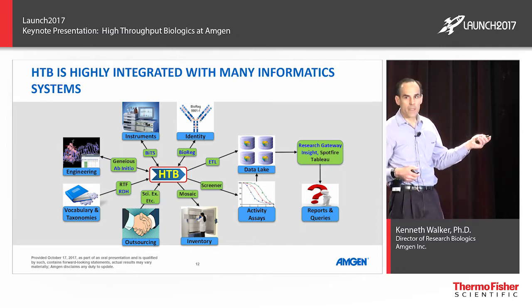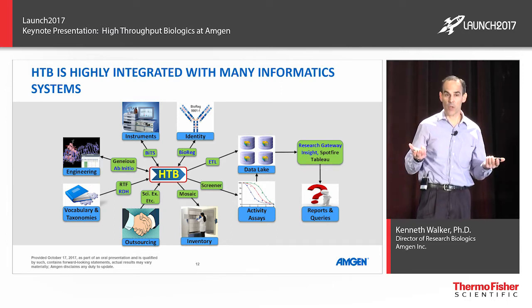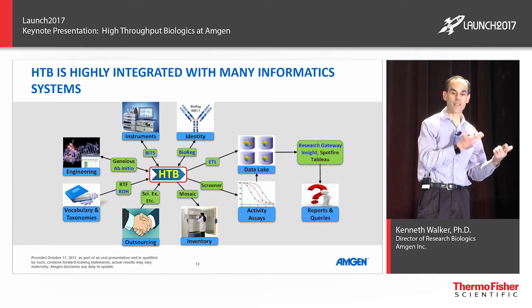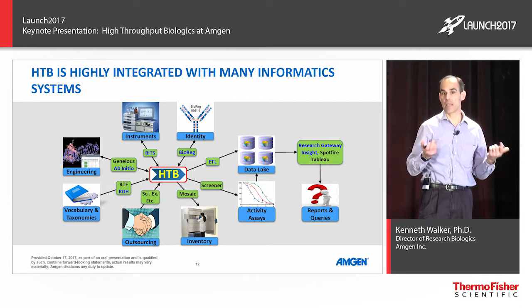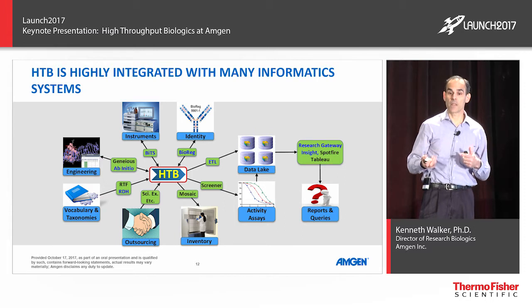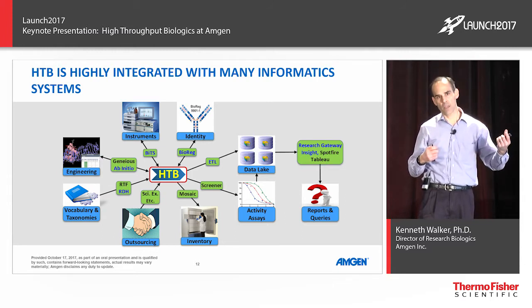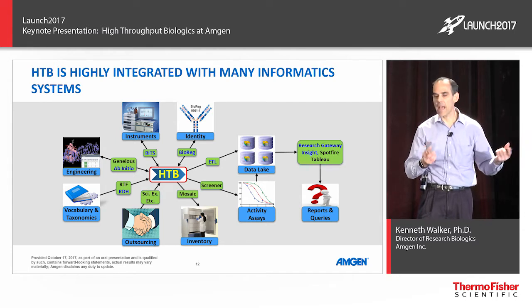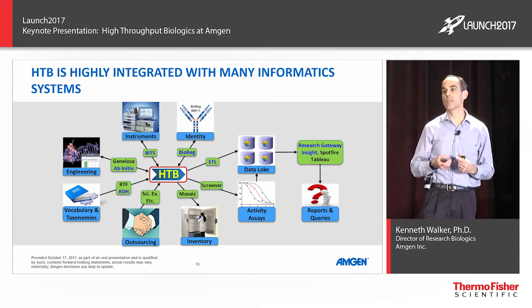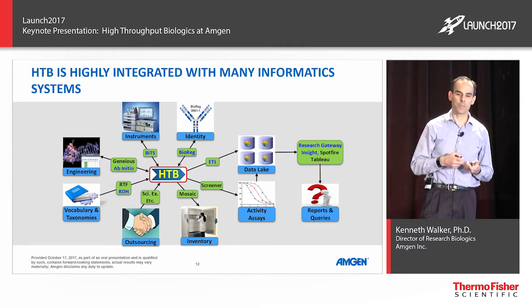We have our BITS system here, which was a system that we used to interact with the instruments, so it acts as the interpreter. So basically it takes these proprietary formats, converts them into a universal format like a CSV type file or other type of tabular data, and then sends them to HTB. But it also acts as a two-way communicator. So for instance, for our liquid handlers, you might actually create your work list within HTB. The BITS module then takes that work list, sends it to the liquid handler. The liquid handler does its task and then sends information back to HTB to tell HTB what it actually did. And so there's some two-way communication in there with that part of the system.